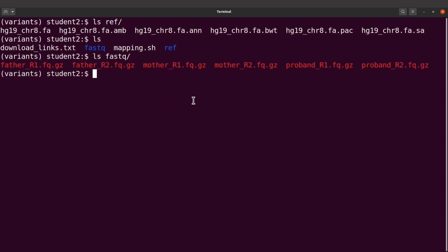And if you are dealing with multiple samples, like in this case, then it's important to also factor in some key information that will help you to write scripts to automate the process of mapping. I've already covered an entire tutorial on that. Check the description where you'll find a link to that video.